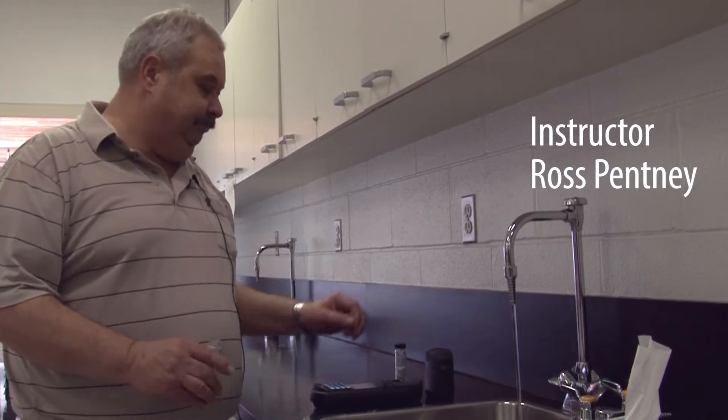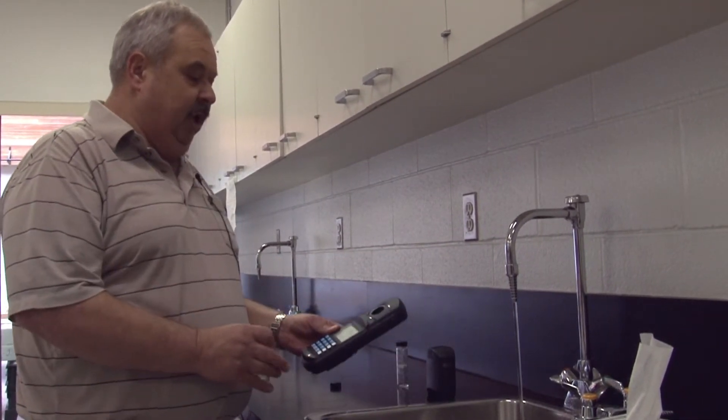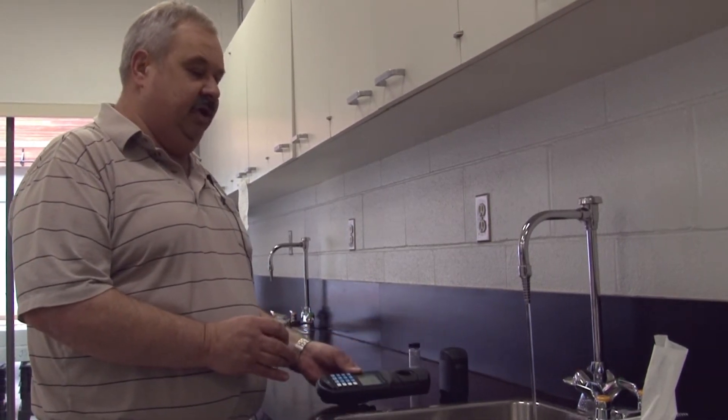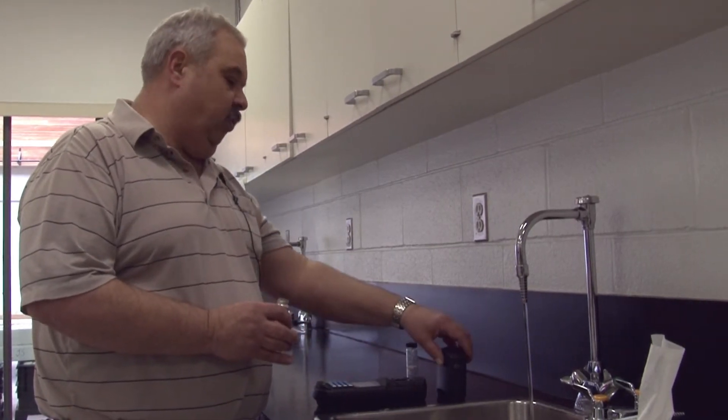To do the chlorine test, use a DR890 colorimeter. This meter will test the chlorine by using the colorimetric system, so what we're going to see is a color change in the water.